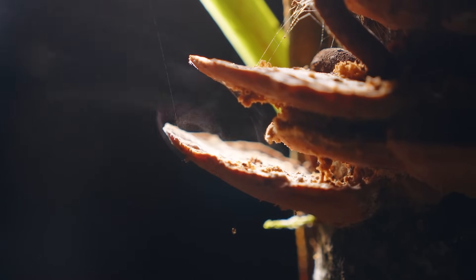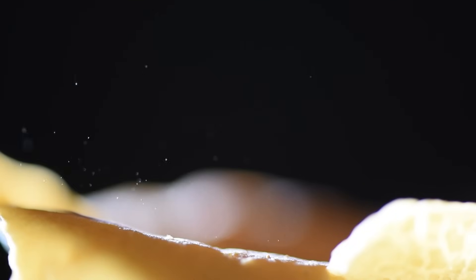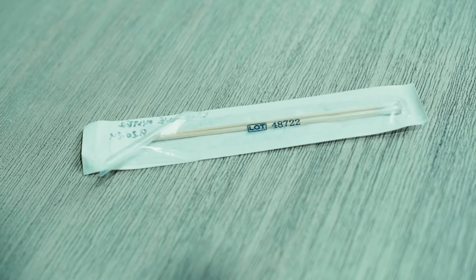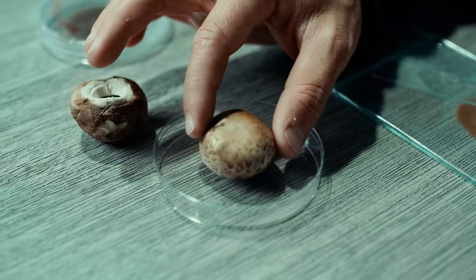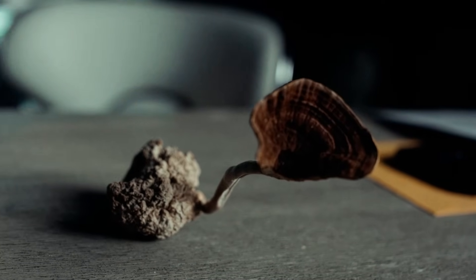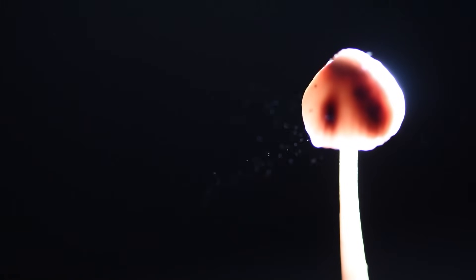What if a single pair of spores could launch an entire mushroom empire from anywhere, whenever you want? Today I'll show you four foolproof methods — using sterile swabs, spore prints, syringes, and even dried fruits — to capture and store spores with maximum viability. Stick around because later I'll share a tip that could slash contamination by up to 90%.